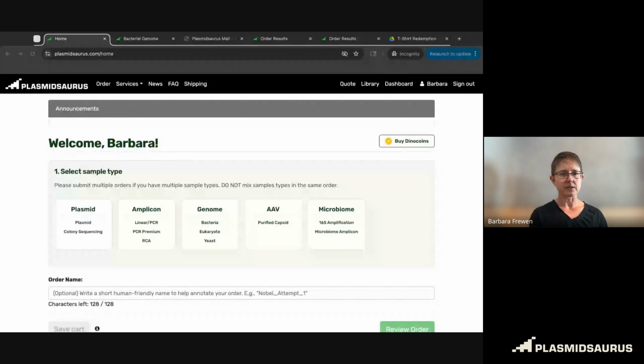All right, so let's actually start looking at our product. I'm going to share my screen, and that's another technical challenge. We'll see if it works. All right. So here we are.